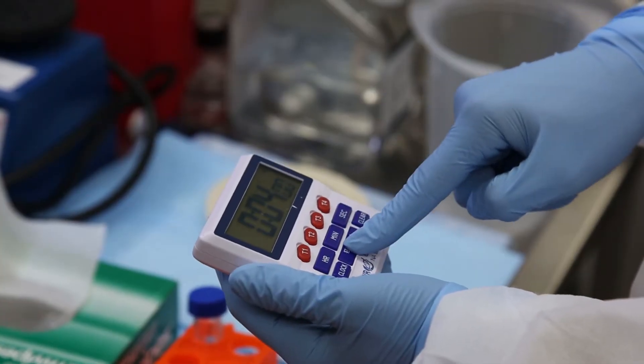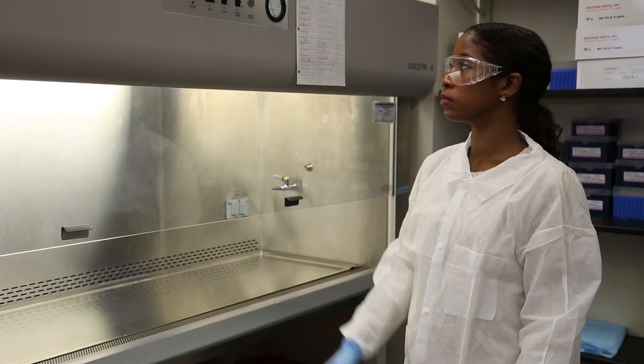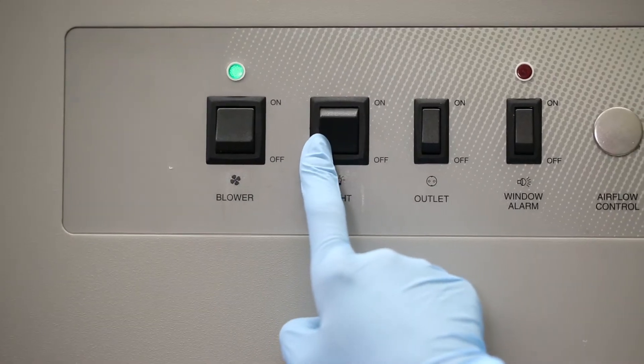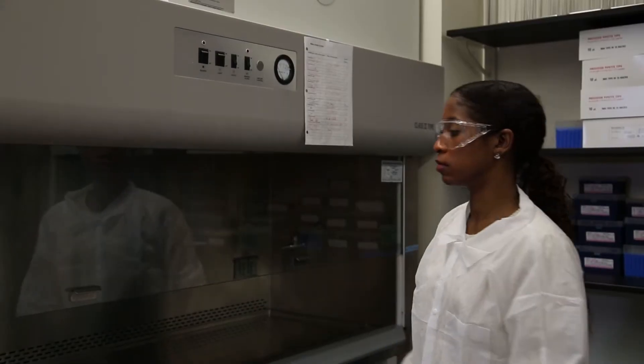Leave the blower motor running for at least four more minutes to purge the air. After four minutes, turn off the lights and blower and close the sash.